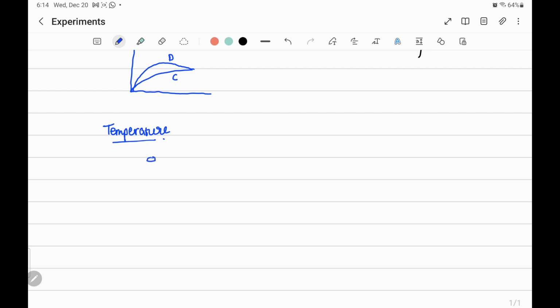You are going to once again need a flask. And you're going to need a square paper with a cross on it. And what you're going to do is place this flask on top of this paper. So I'm not sure if I can draw it. I probably can't. Okay, well, it's not obviously the accurate drawing, but this is an eye. When you look through this, you're going to be able to see the cross. It's visible because this flask is standing on top of this paper.